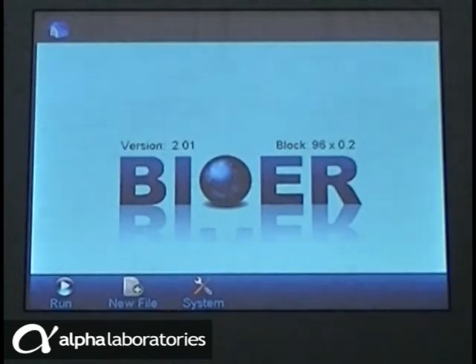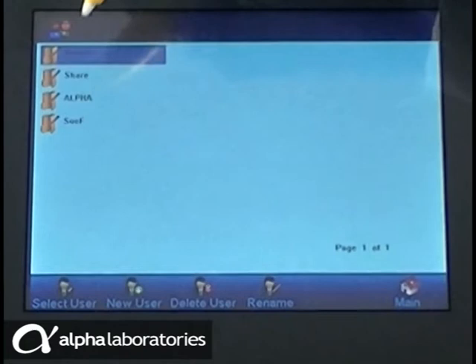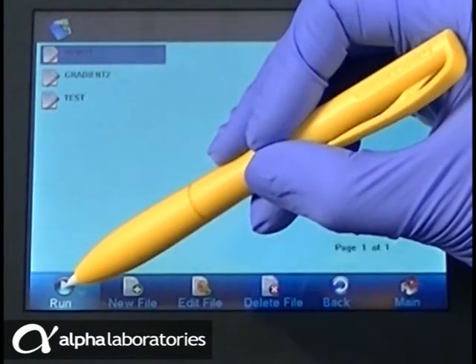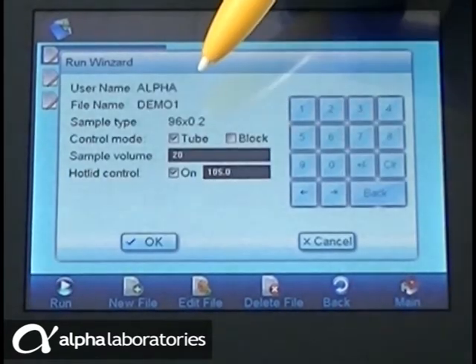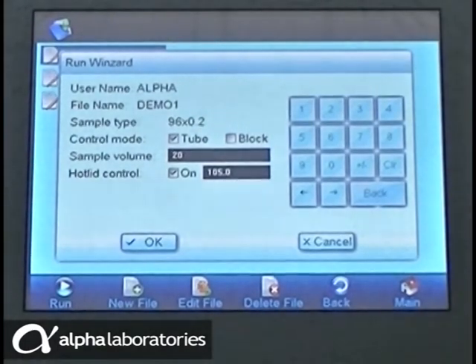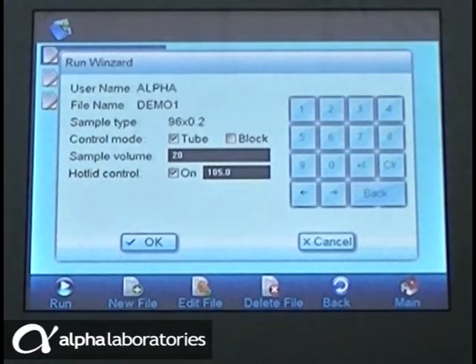When you are ready to run your PCR assay, select Run from the main menu and locate your required protocol. Touch Run again. Choose whether you require the set temperatures to apply to the tube or the block. Tube temperature uses an internal calculation to estimate the actual sample temperature in the vial. This is more accurate but takes longer. For robust PCR protocols that need to be run faster, choosing block temperature may be preferable. Enter the volume of your samples. This is very important when using tube control. The hot lid may be turned on or off on this screen and the temperature set between 30 and 110 Celsius.